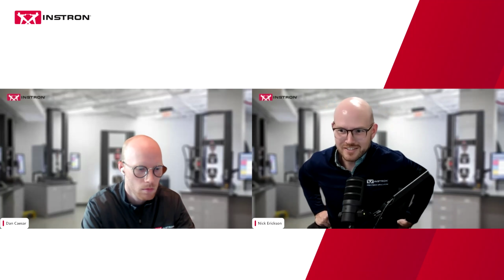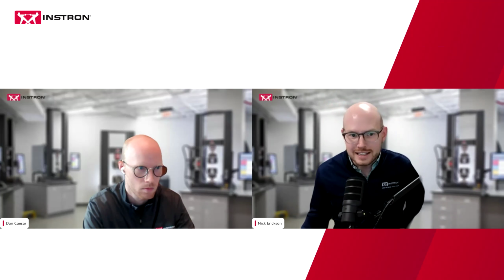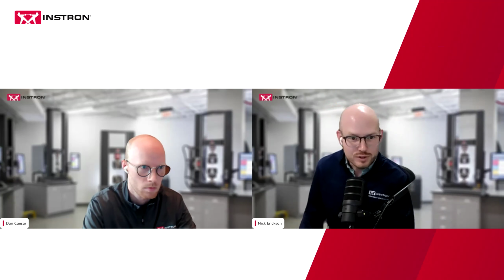All right, it's 11 o'clock, so we will get things going. Thanks everybody for joining us. Today, we are taking a look at new features in Bluehill software that are rolling out in our July 2024 release. Thank you so much for being here.